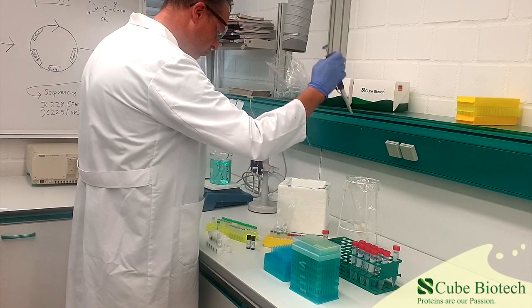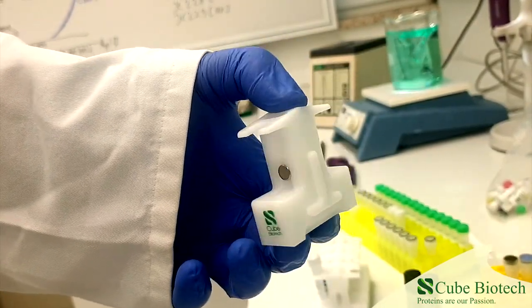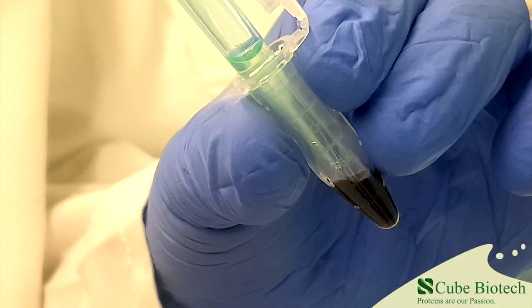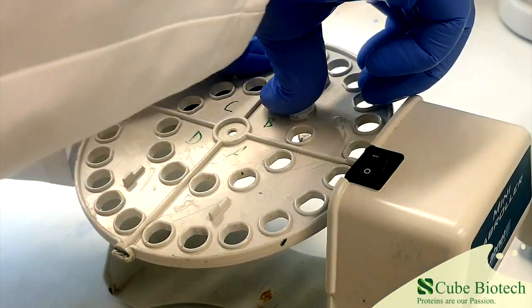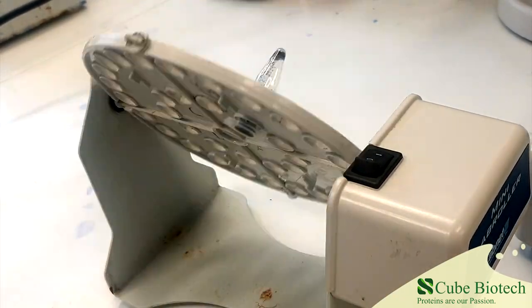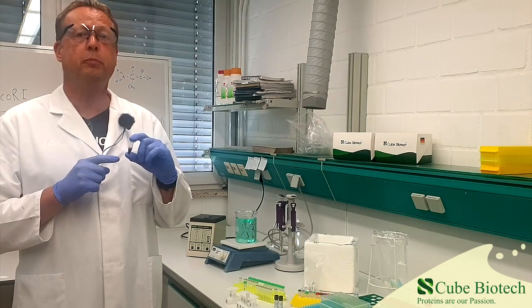Subsequently, we remove the incubation buffer while the MAC beads are bound to a magnetic separator. We here at Cube Biotech have our own MAC bead separator for this. Now it's time to add the HisTag GFP to the MAC beads. Put the tube on a rotator and let the MAC beads and GFP rotate for about one hour. Our GFP proteins have now been bound onto the MAC beads.